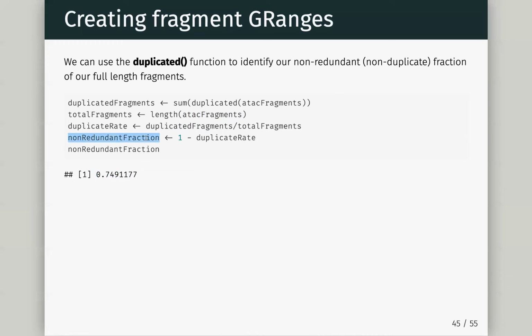There's quickly another QC we can check. We hope that not much of our data is too duplicated, right? Given the size of the genome and the amount of open chromatin there should be, we wouldn't expect too much duplication.